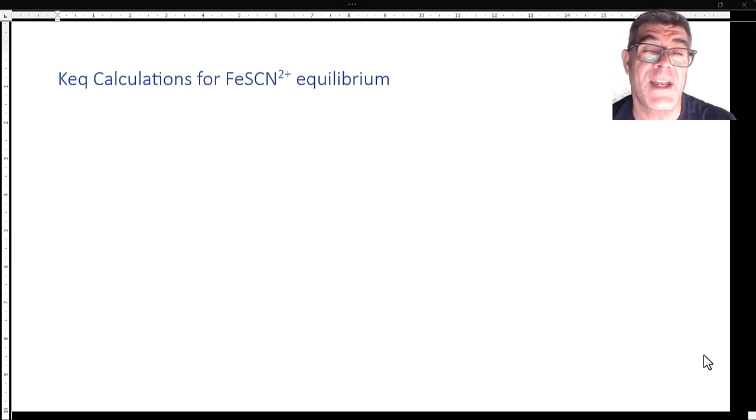I think the fact that I started with a higher concentration meant that I had some very high absorbance values, and it was much more difficult for me to get those high values back towards the origin without skewing my line in some ways. But we've got some numbers, so let's see what we would do with these.